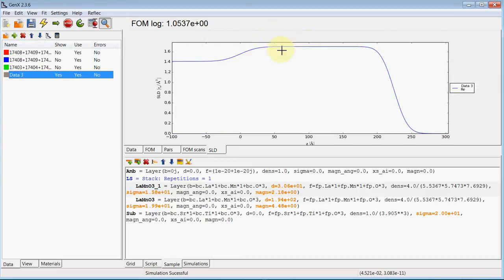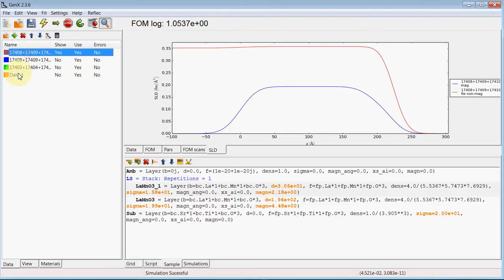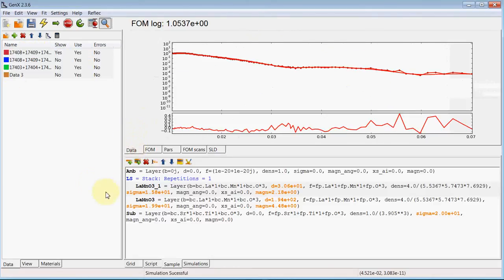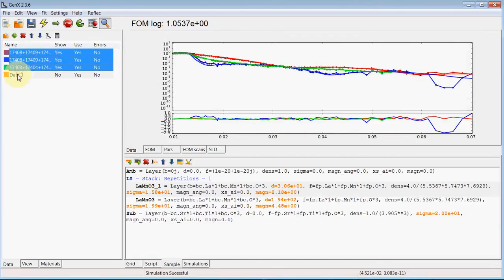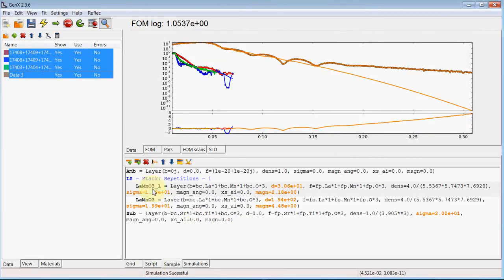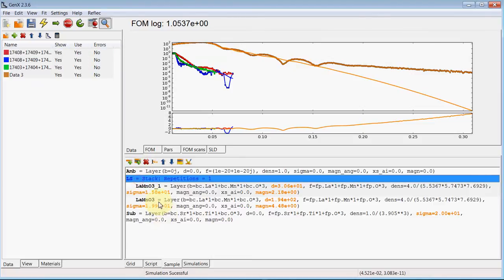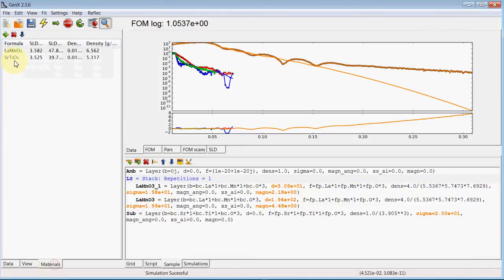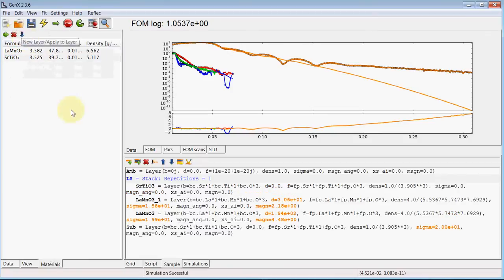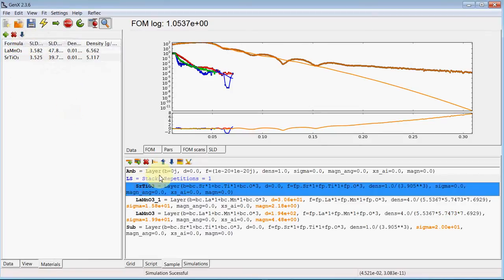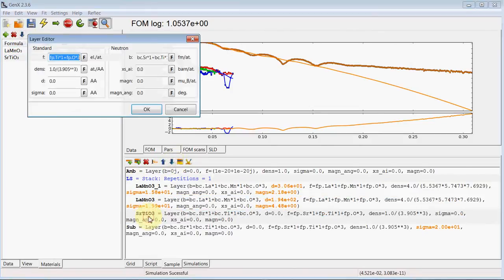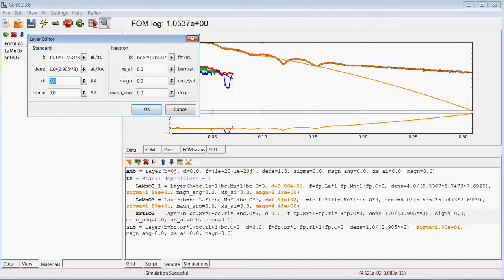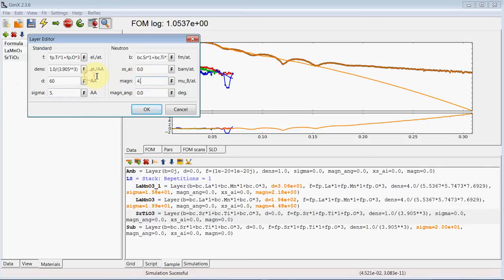To be able to fit all the data sets together, we want to add a new layer below the LMO that has the same nuclear scattering length density as STO but is magnetic. We go again to materials, add an STO layer, and move that to the bottom. We'll try with 60 angstroms of STO with 5 angstroms roughness and 4 Bohr magnetron.